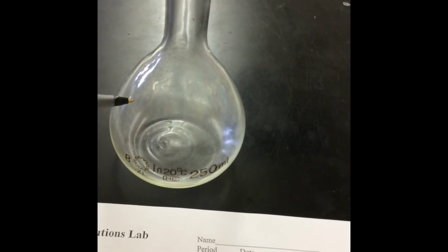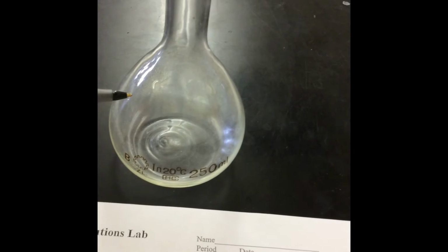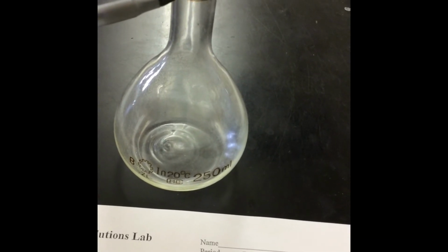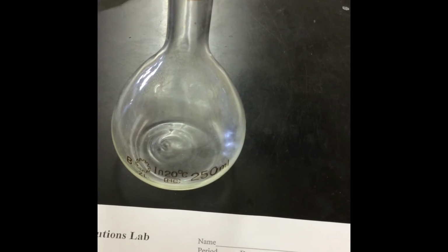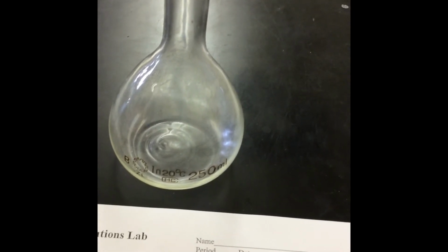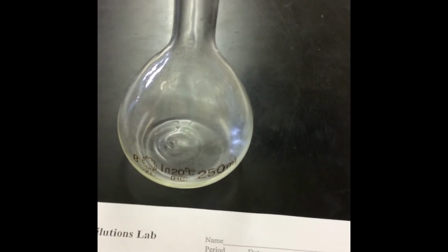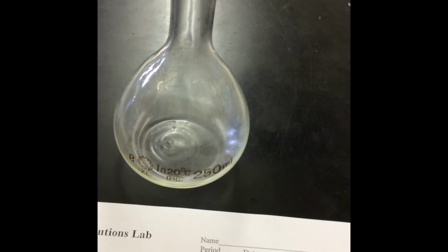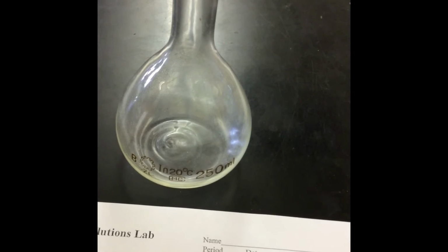Just be careful when you're shaking it. Use 2 hands. And then once you have that mostly dissolved or all the way dissolved, you add water up to this line so the meniscus is at the line. Now once you have it at that point, I would then put my finger over the top, basically to stop the liquid from falling out, and invert the volumetric flask a couple times.